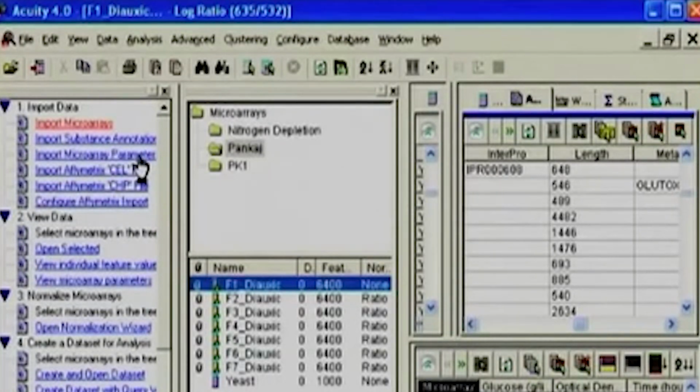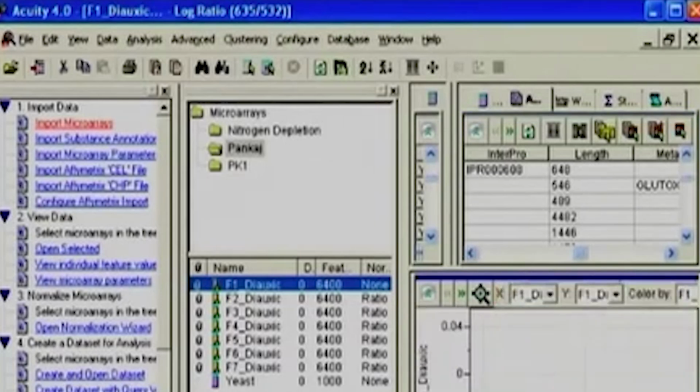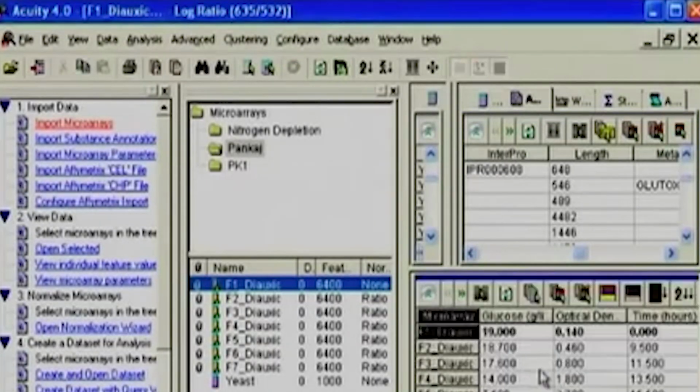Right. This can be made again in the text delimited form and can be renamed to .mdt file, and this again can be imported to look at. All the parameters are visible in the form in the down window here. In a few seconds more you will understand what each window means, but as is the case, you can just switch over to different types and go to a parameter file and look at what all details I have.